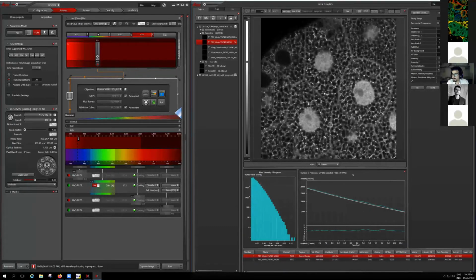And there is a suggested minimum number of photons per pixel. It says suggested minimum number of photons per pixel to avoid overfitting or deviation. Dovidas is asking this question.